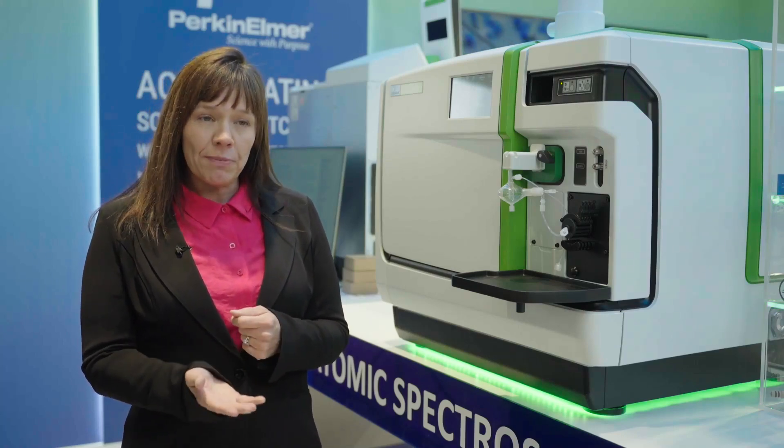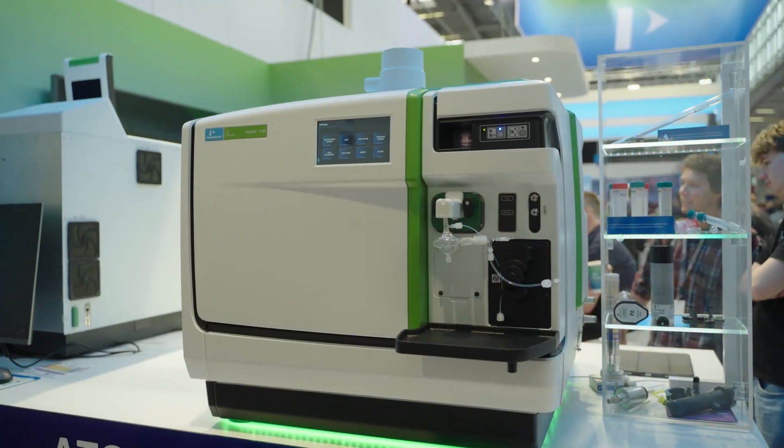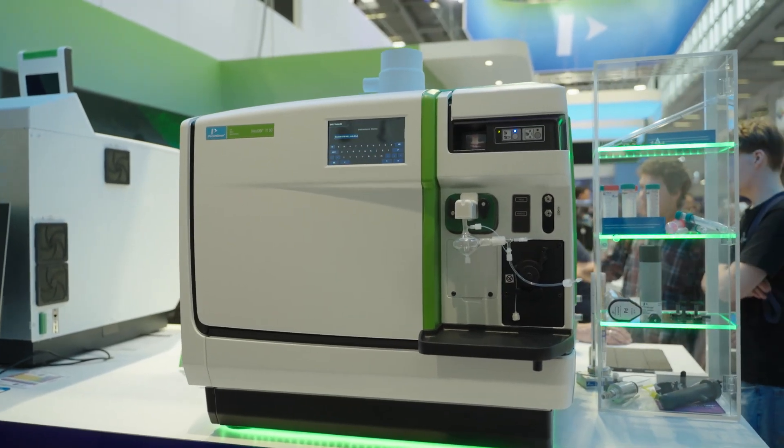If we talk about performance, the Nexion 1100 is our entry-level system. However, that doesn't mean you're sacrificing performance at all.